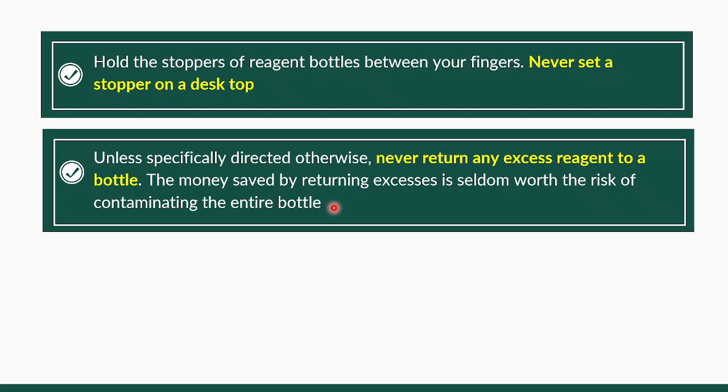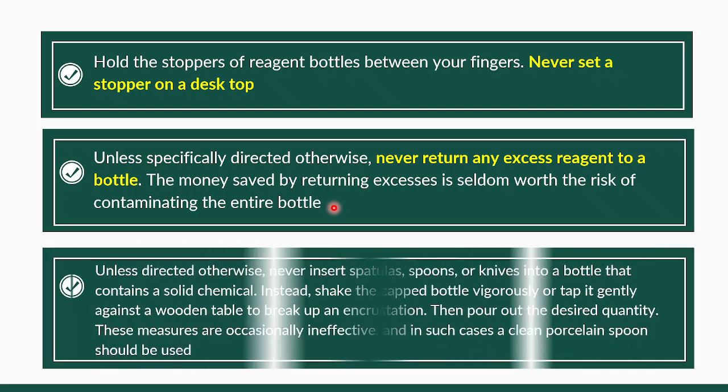Basin na-contaminate na to siya with the other chemicals, no? So, dili na pwede nga ibalik ang mga excess reagents sa iyang original nga botelya, kay makontaminate na ang sulod atong botelya or atong chemicals, no?